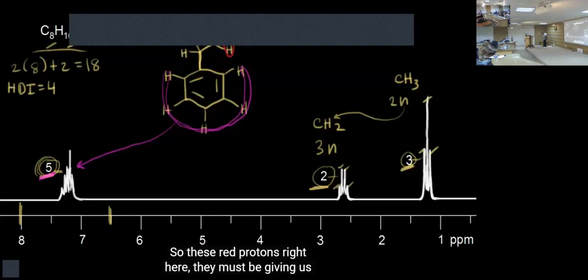And when you see this multiplet, these are all multiplets. And looking at the integration, you know there are 5 protons, and the value lies in the aromatic region, right? More between 6 to 8, it's aromatic. So all these protons lie in the aromatic region, and there are only 5 protons. So you expect, okay, they are all together, and there is no substituent in between.